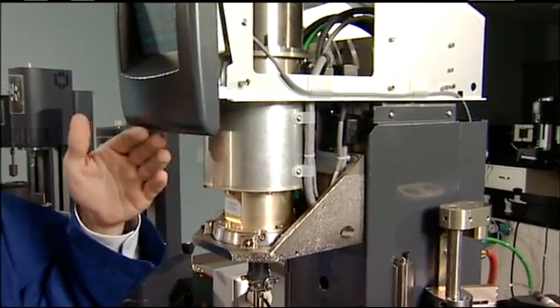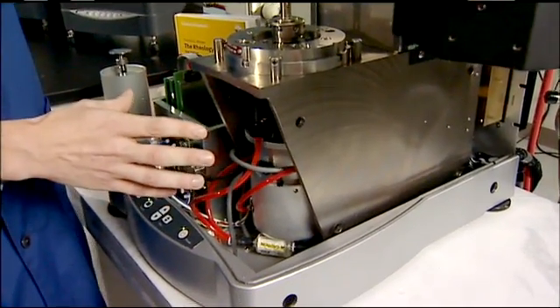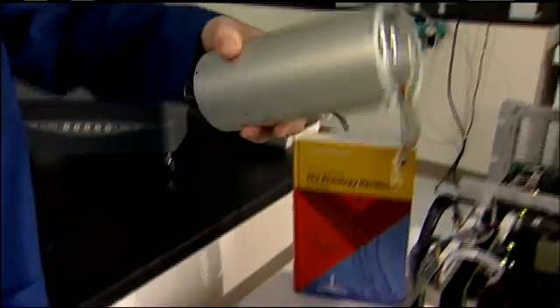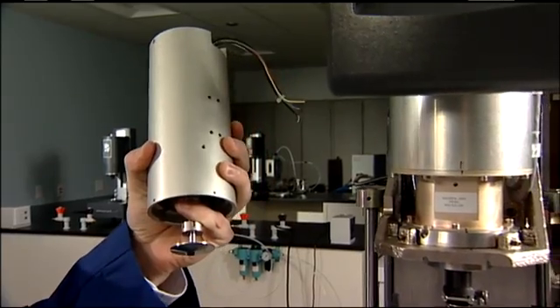Only the Aries G2 with separate transducer and motor is capable of these independent measurements. Some manufacturers would lead you to believe that their single-head rheometer can do what an Aries G2 can do. It's physically impossible.